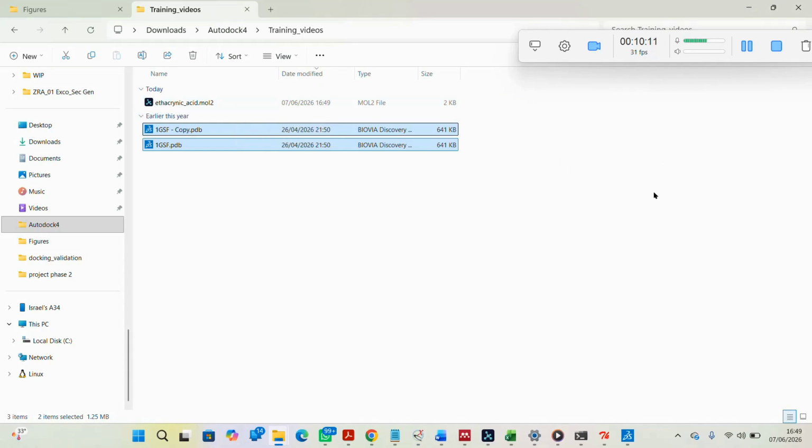So this is how to extract the ligand from the protein. In this case, like I said, because we're interested in validation, but the compounds used for your study can come from public databases like PubChem, ZINC, and what have you. But what's important is we now know how to identify the grid. There are several ways of doing this, but this is a very easy approach.